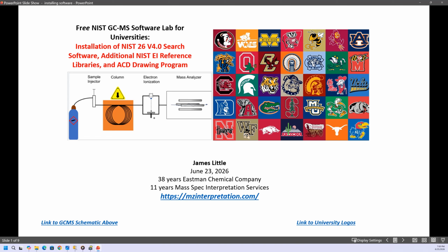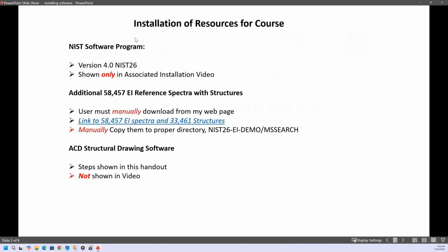This video is part of my free NIST GCMS software lab for universities. It will include the installation of the NIST 26 version 4.0 search software, additional NIST EI reference libraries, and the ACD drawing program. It is also accompanied by a handout, and certain things will be shown in the handout that will not be discussed in the video and vice versa. So you'll really need to look at both to accomplish the installation and understanding how the software is used with the different files. This is a summary of the installation of the resources for the course.